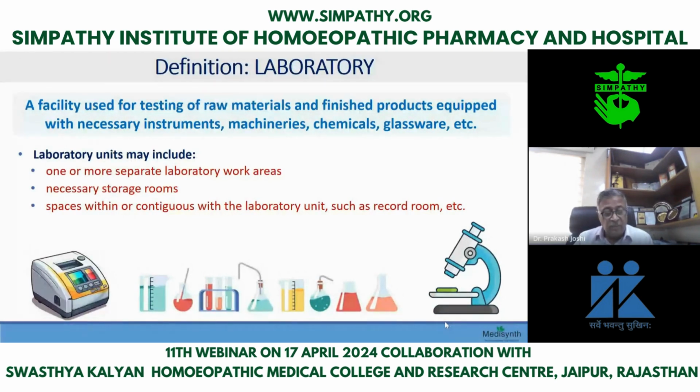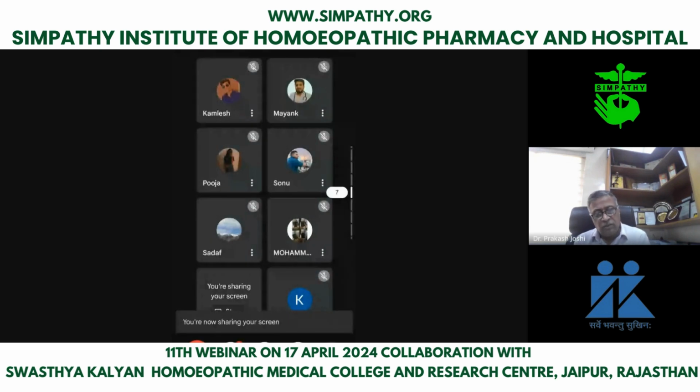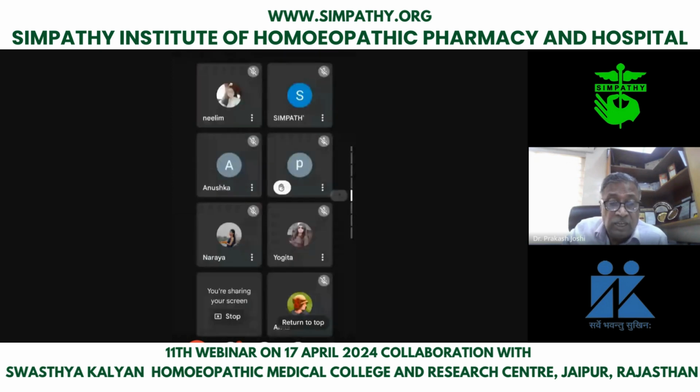After the raw material, they prepare the mother tincture, as you all know. For mother tincture, there are two methods in the HPI, percolation and maceration. Once they prepare the mother tincture, they have to test it as per the pharmacopoeia. The pharmacopoeia mentions the raw material and the finished product. For the finished product, first of all, the alcohol percentage, that is, what is the alcohol percentage in the mother tincture? Then total solids, pH, then TLC, UV studies. That will come later in our next few slides. But again, when we are saying that we are using alcohol.